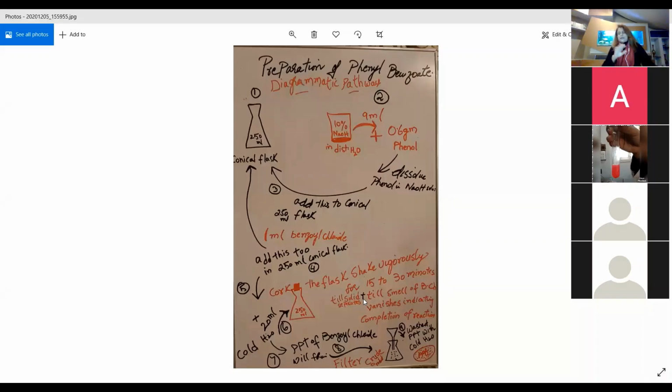Now what will happen, these will all get dissolved, just as the sodium hydroxide pellets got dissolved when you made the solution. There was only a very little amount of solid left, so that was all in the diluted, solution form.